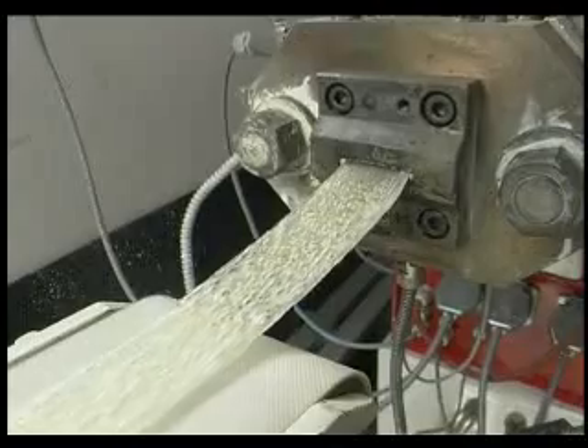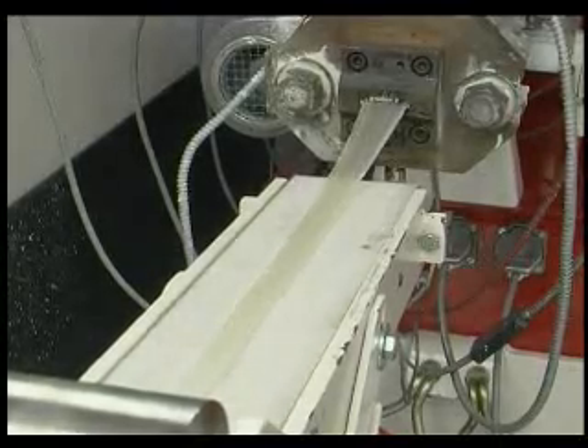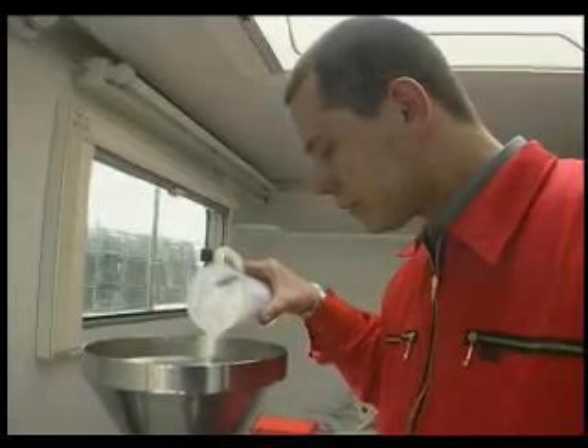The melt from the flat sheet nozzle allows us to judge the composition of the plastic. Due to the increase in pressure of the melt from the nozzle, we are able to tell whether polymeric contamination is existent. There is a screen pack changer built in front of the nozzle to allow for other results.